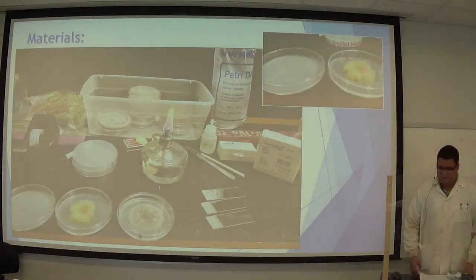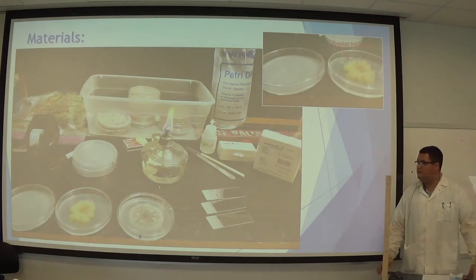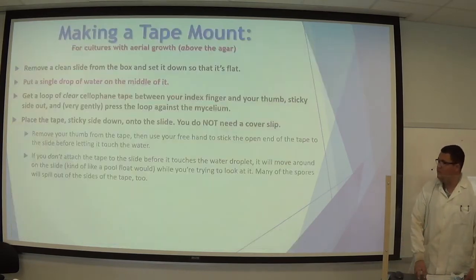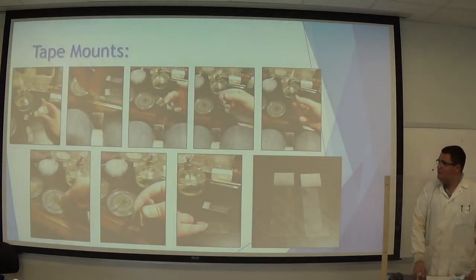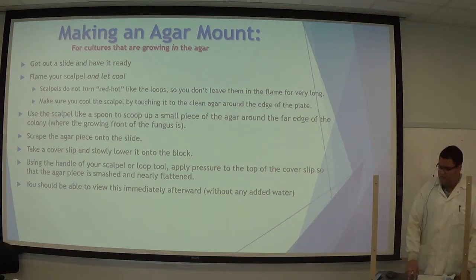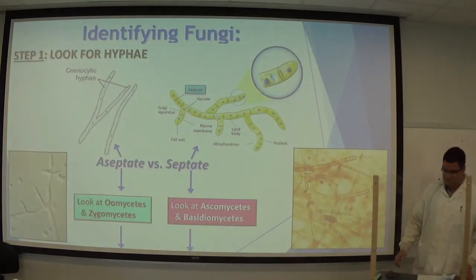For those of you that are online, and also you guys if you want to see it online, Blake goes in detail on how to make slides for both agar mounts and the tape mounts, which I'm going to show you guys here, so I'm not going to play Blake's audio. Again, this is just more info on how to do it, and here Blake shows how she did it. More info on making the tapes. Here's the important part.